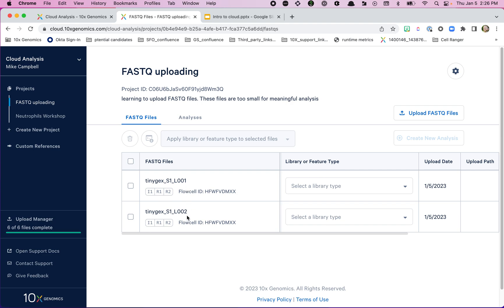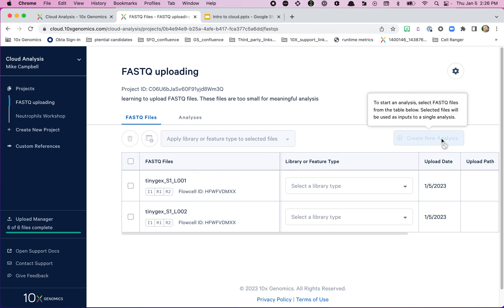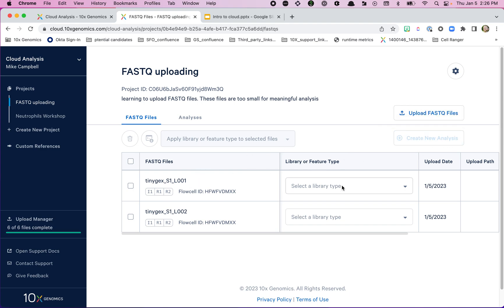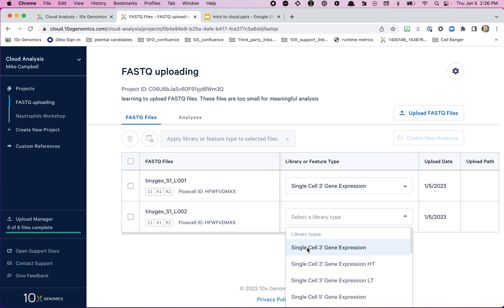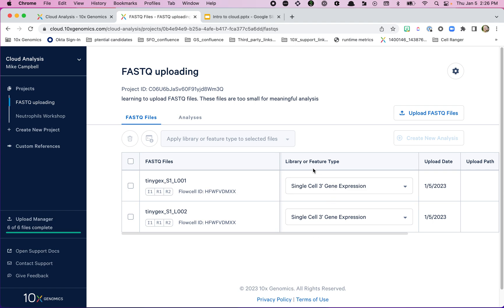We had two sets of files, one from lane one and one from lane two. They're both from the exact same library, just run on two different lanes, so we do want to include both sets of FASTQ files in the analysis. We can see there are three files here: I1, R1, R2. Before creating an analysis — which we're not going to do for these since they're too small — we should set the library type, because that lets Cloud know what pipeline options to give you. I'm going to call them 'Single Cell 3 Prime Gene Expression.'